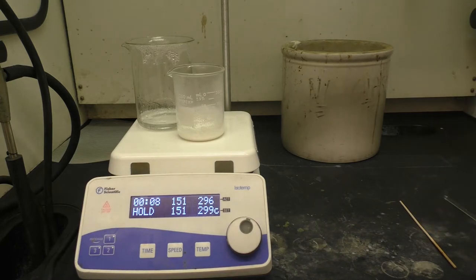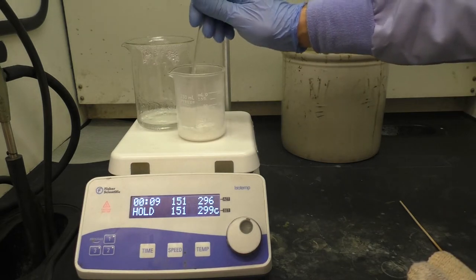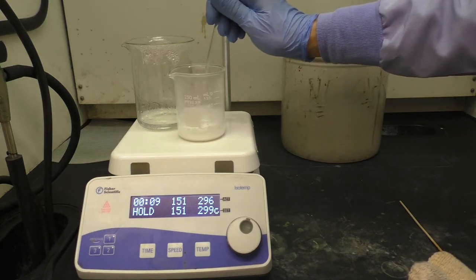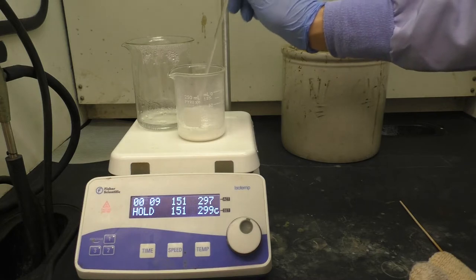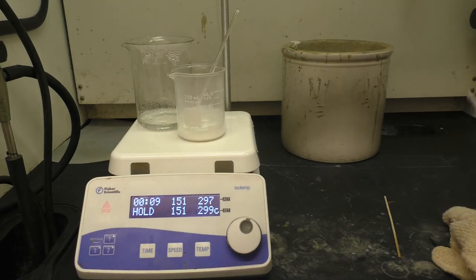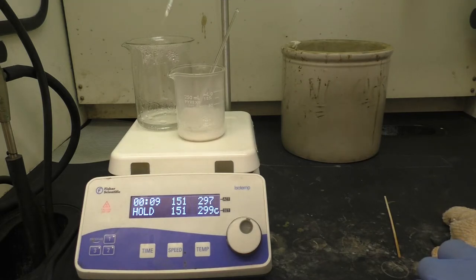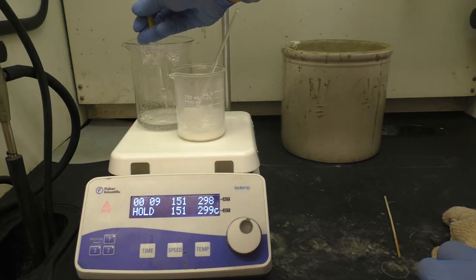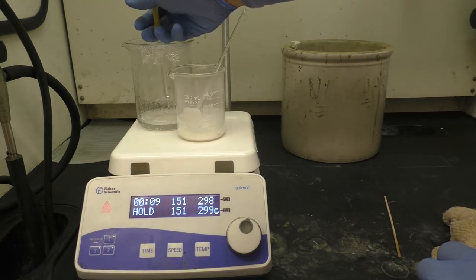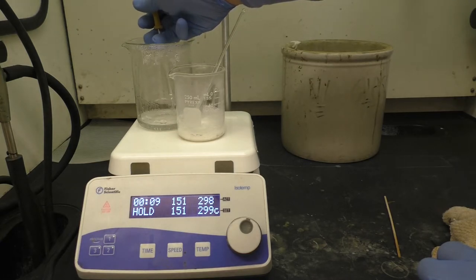I can stir with a stir rod here to help break up material. And then from this point, I want to start to add hot boiling water to this beaker here until I get everything dissolved. Now to do that, I'll just take a pipette, and I may need quite a bit given the volume, but I'll take a pipette, grab some of that hot water, and then squirt that in here to the beaker that has the product that we're trying to recrystallize.